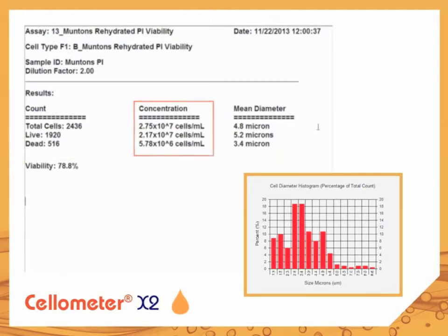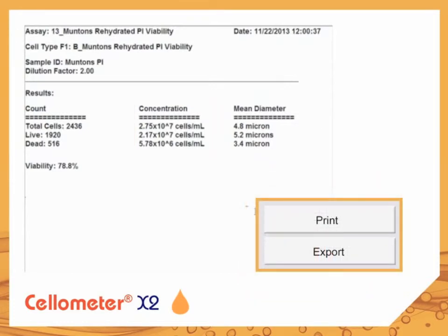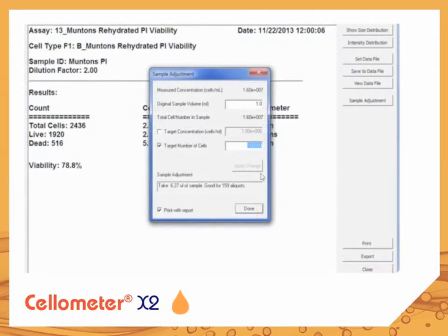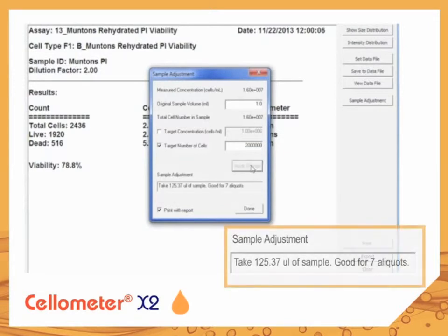Results can be printed or saved to a network location in text or Excel file formats. To meet desired target cell concentration or cell number, the software includes an intuitive sample adjustment calculator.